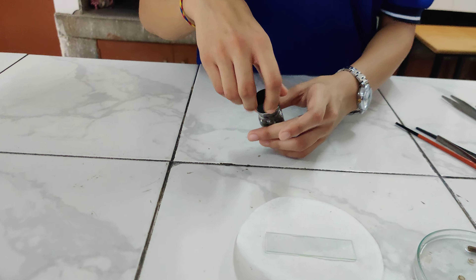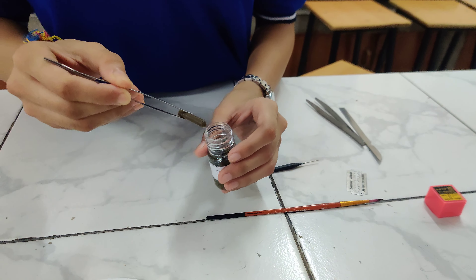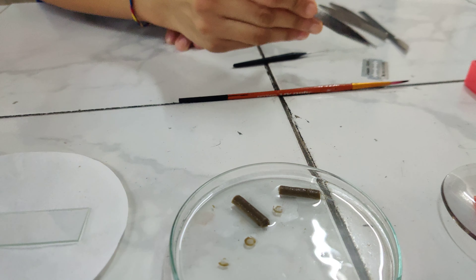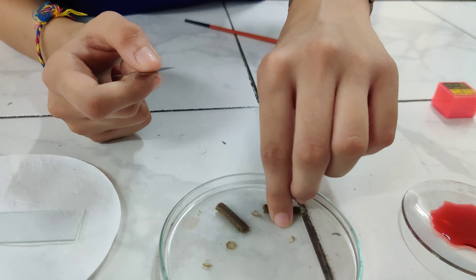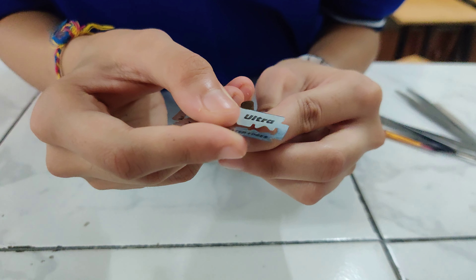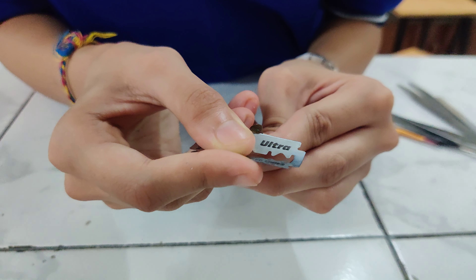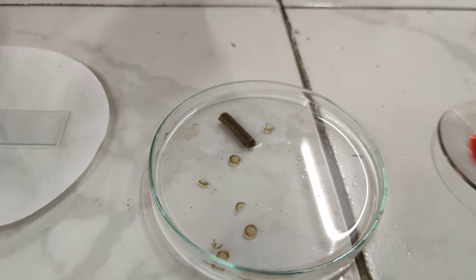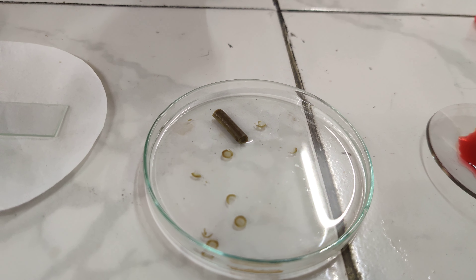First of all, take out the preserved stem of dicot and keep it in water so that it will not get dehydrated. Now take a fresh blade and make very thin sections of the stem, holding it in this particular way. Try to make complete thin sections and put them into water so they remain hydrated. Make many sections because we have to choose the finest section among them.